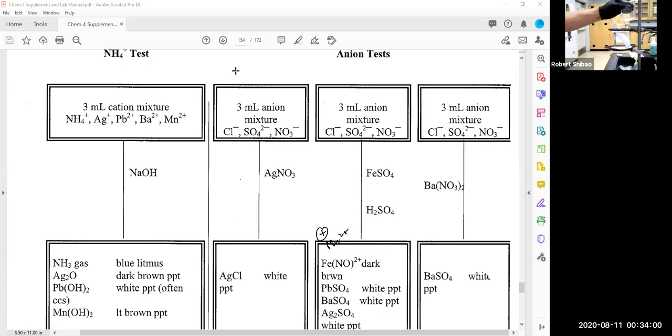Try warming it up a little more. Wow, this is kind of interesting. What happened to my white precipitate? Take a look. The white precipitate appears to be dissolved. I still don't see any blue. I would see a gradual change in blue. So I'm going to set this aside in case it's a slow reaction.